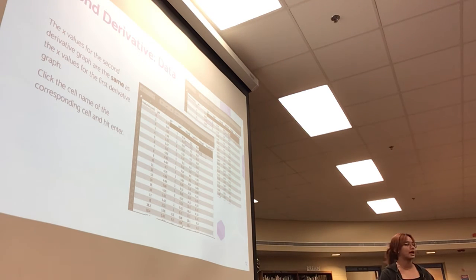So for this, as you asked before, if you want to just enter these corresponding ones, you just hit equals, then enter that data cell and hit enter, and then copy the formatting down. Or you could just select the entire cell, hit Control C, and then copy it right where you want. However, that will copy the formatting of the cell as well, like the shading, the fill, all of that.